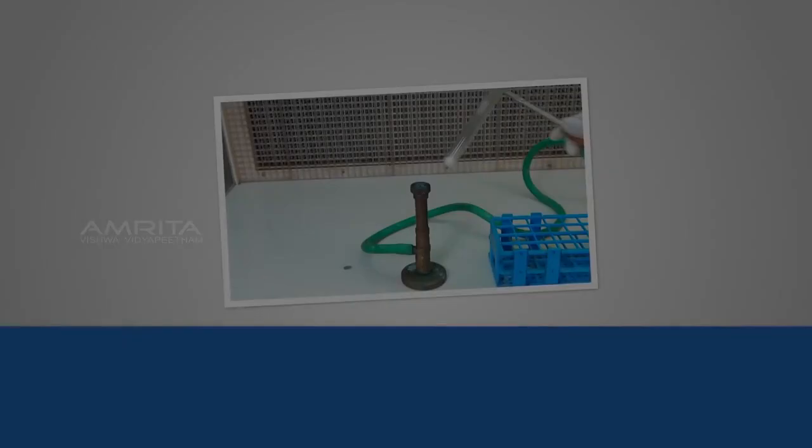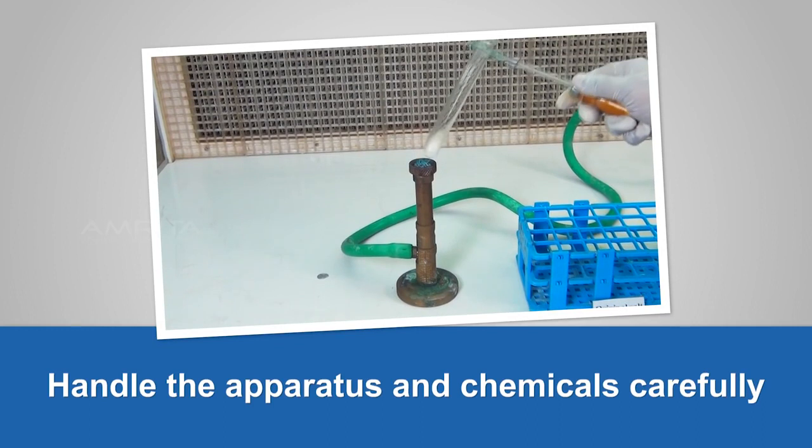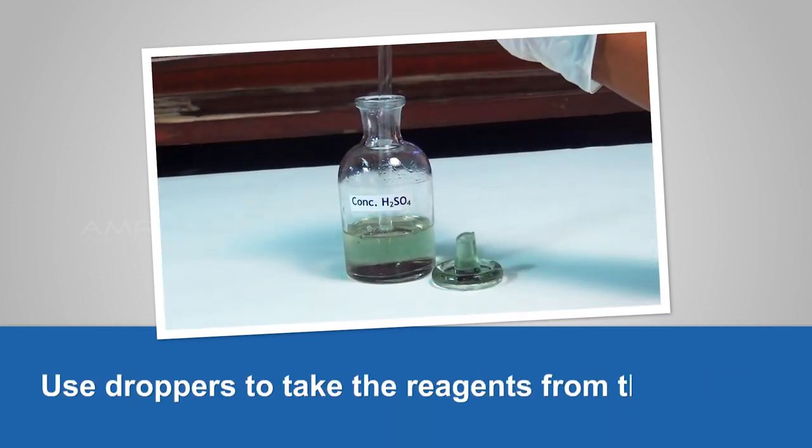Precautions: handle the apparatus and chemicals carefully. Use droppers to take the reagents.